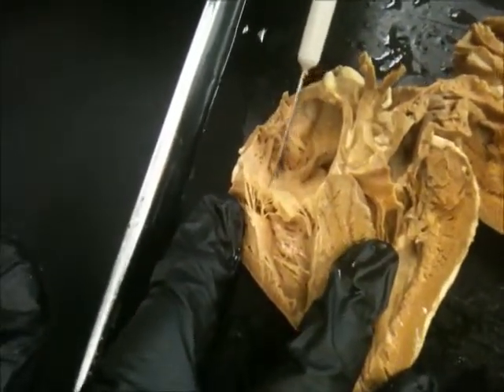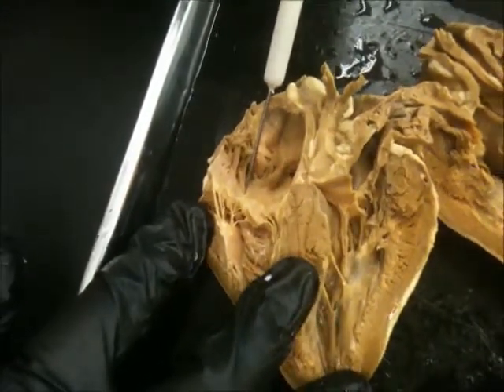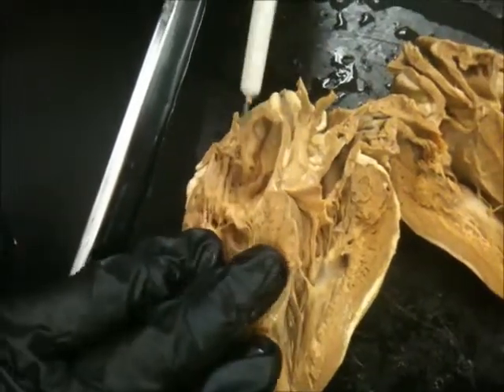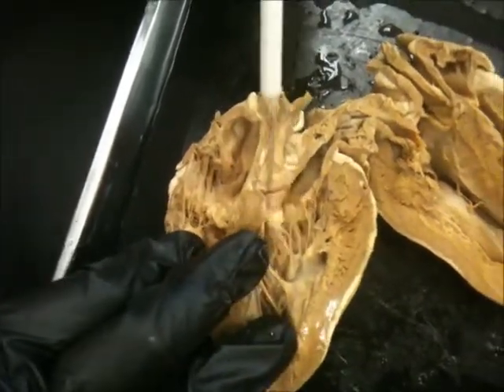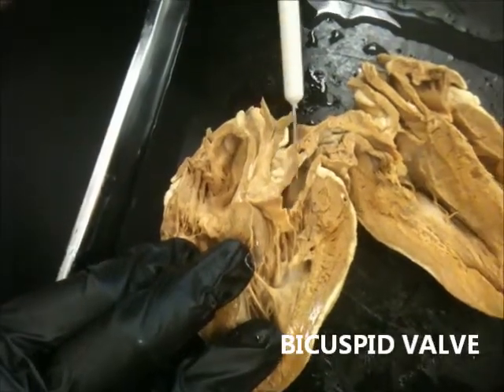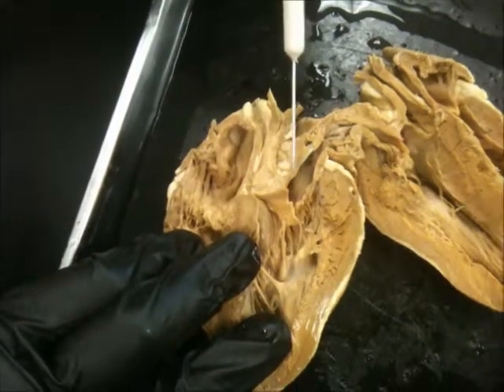And this is in the right... so it's which valve? Tricuspid. Tricuspid valve. So you have the tricuspid valve and you have the bicuspid valve.